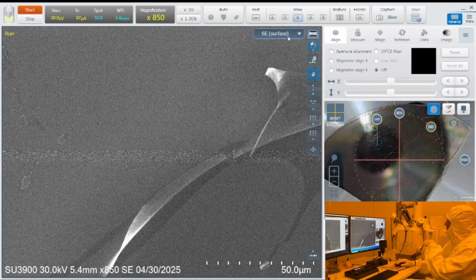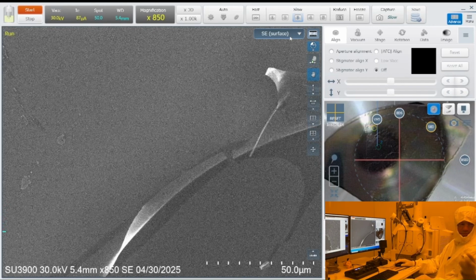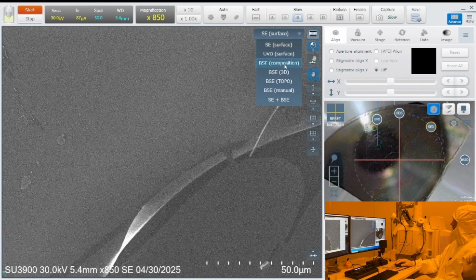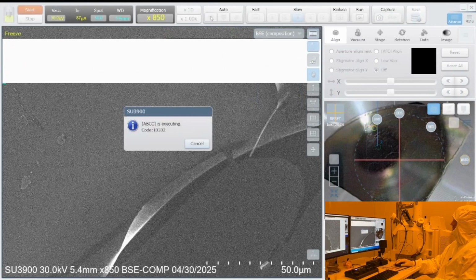Are you trying to see a difference in the thickness? We're trying to see those structures, those grating-like structures. So you should see those lines, straight lines, gratings, ordered 200 nanometers wide.